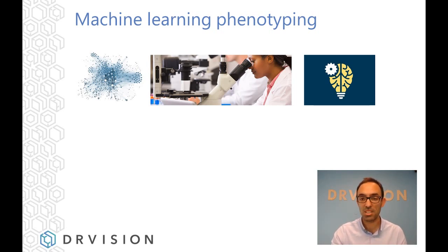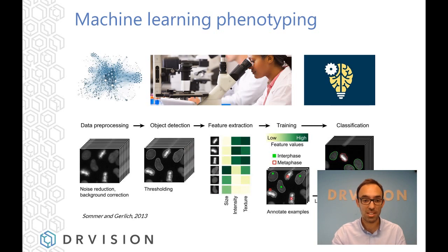That's the intermediate step, and then you can apply the new classifier on all images, and this is automatic and very fast. So the first stage is data processing and object detection. That's what I've talked about until now, either with the 3D object detection recipe or with the neuron detection recipe. That's the first stage.